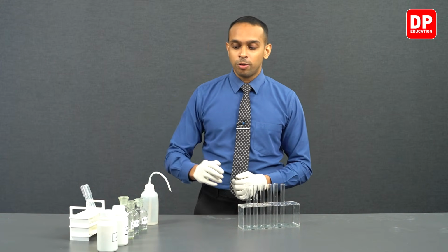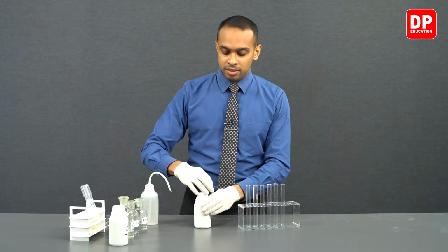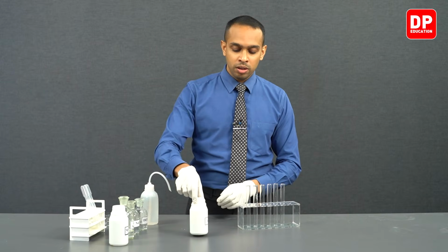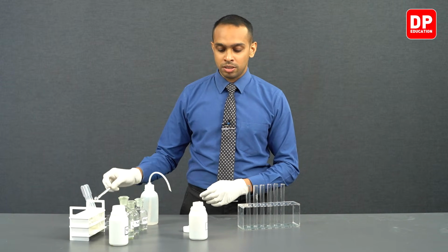So we have over here aluminium chloride. We can take a small solid sample of aluminium chloride into a test tube.